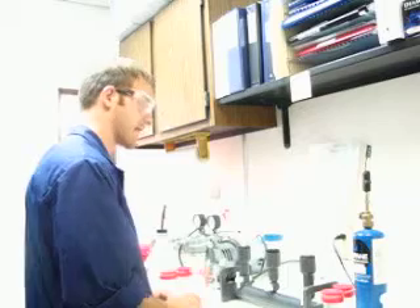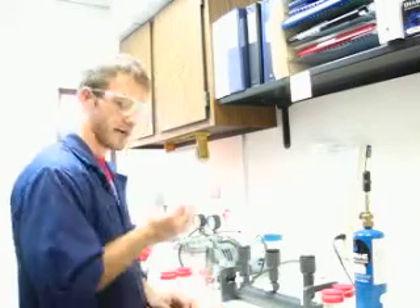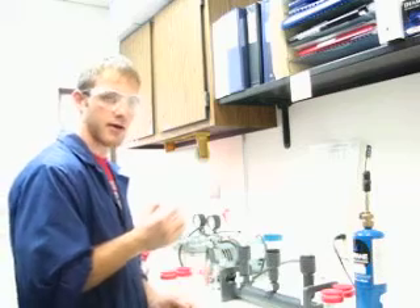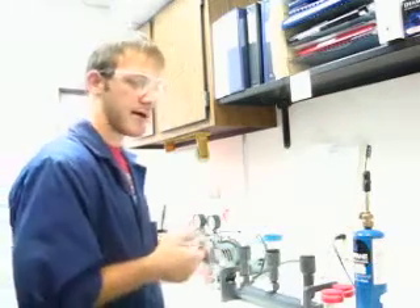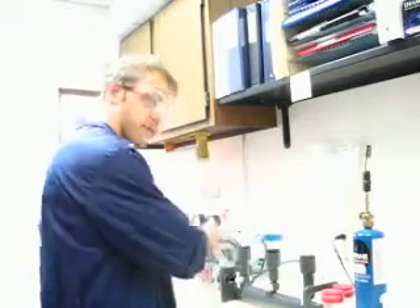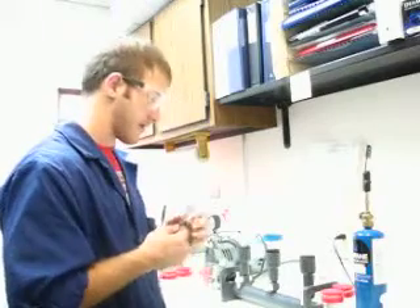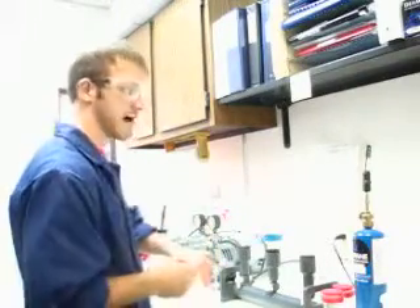So the next step is I want to place this membrane into the petri dish. A reminder: this petri dish serves as an appropriate media for the bacteria to grow. So using these forceps, I will place the membrane into the petri dish, but first I have to sterilize it.